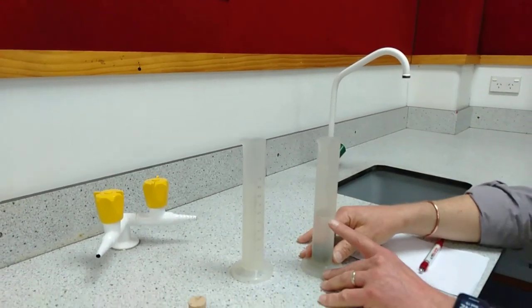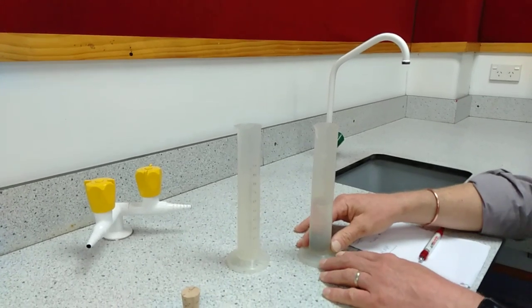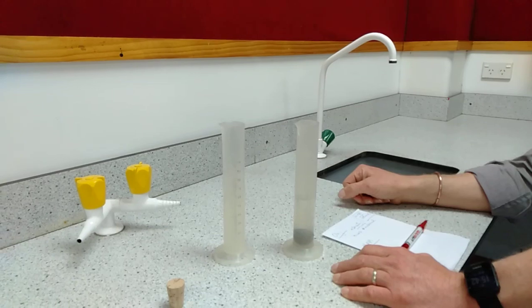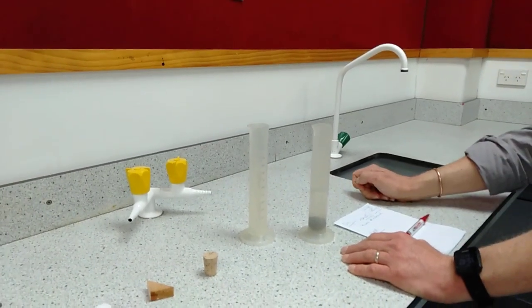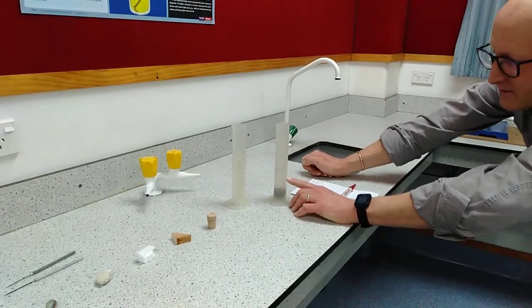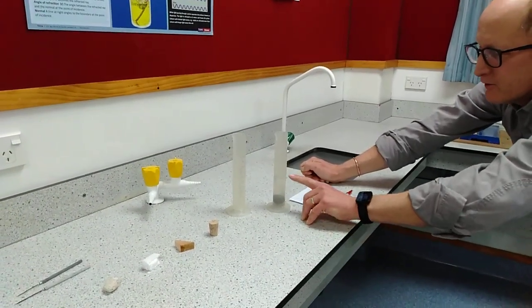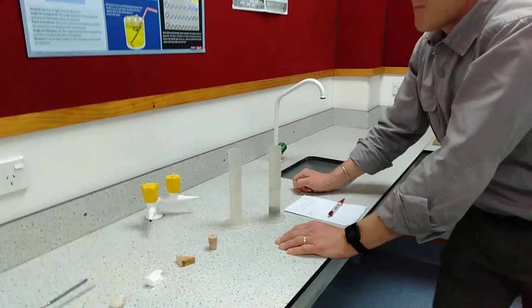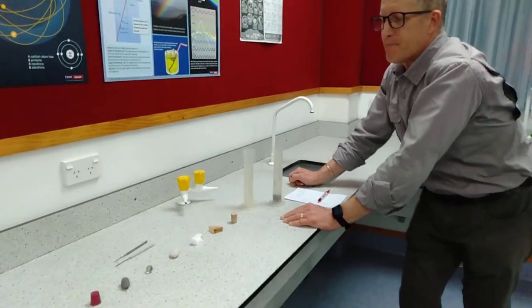We have water plus lead, and it measures 55 milliliters. We can then calculate the displacement of the water by the lead as 5 milliliters. It is 55 minus the 50 for the water that we originally had.